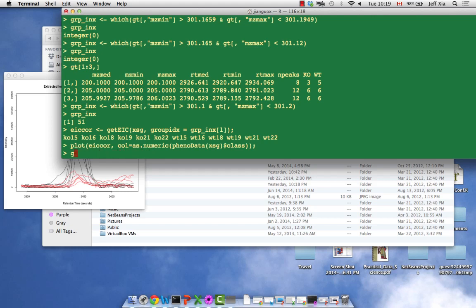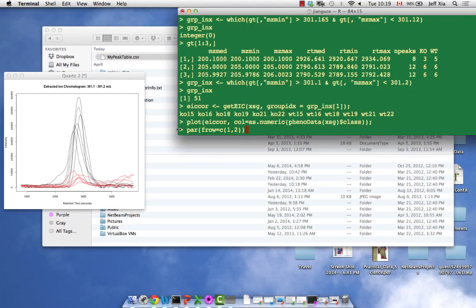You can probably give different names to the plots, a title, and plot them separately. This is a very basic one, I didn't cover it because I assumed you knew. Title equals your name. Now, if you want to plot two side by side, use mfrow, c(1, 2). I'll plot, then tell you what it means.